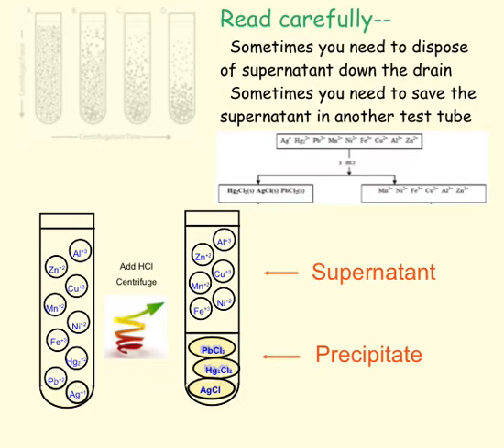Okay, again, with the centrifuging, the reason we're doing this is so that we can separate our solids from our liquids. And what we're seeing is that you've got that solution, and through centrifugal force, it takes the solids and puts them down here, and you've got your liquids, your solution, up on top.